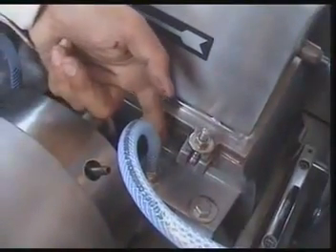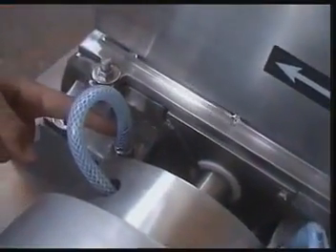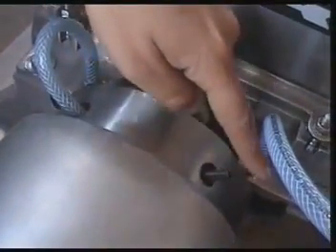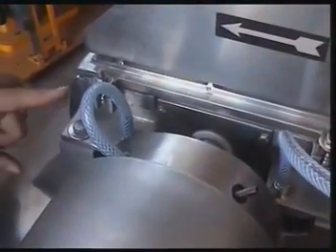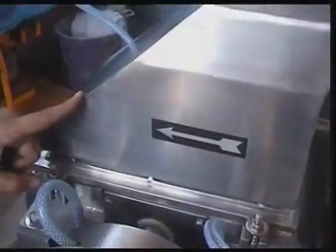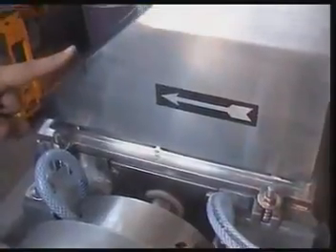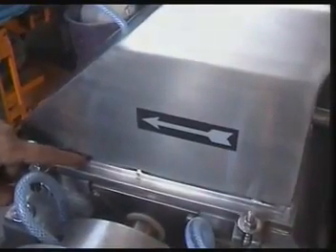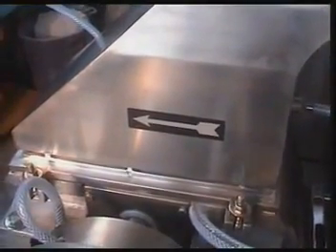This is the other side of the chamber wherein the water enters, and this is the ejection side from where the water comes out. Through this pipe it enters the other pedestal, and this is the final ejection point — the outlet point of the main water jacketing system. The water jacketing system is provided to overcome problems of product material properties being changed, as heat is generated at high speed. Heat sensitive products have their characteristics changed when heat is generated during milling, so the water jacketing system is given to absorb that heat.